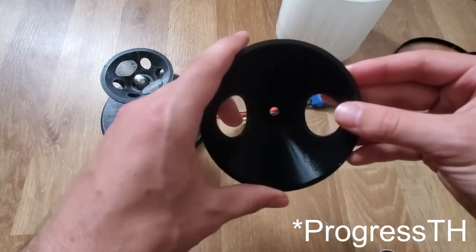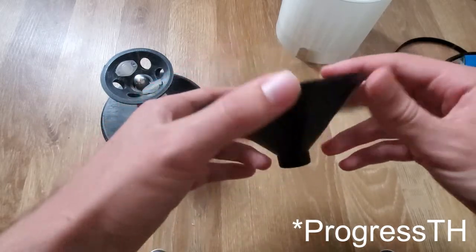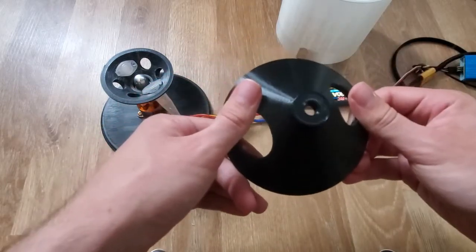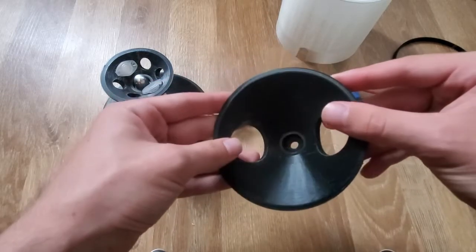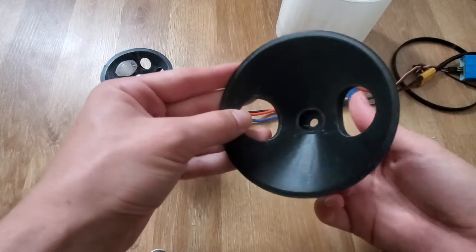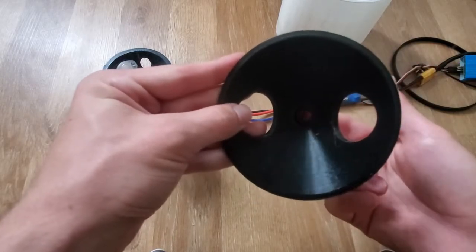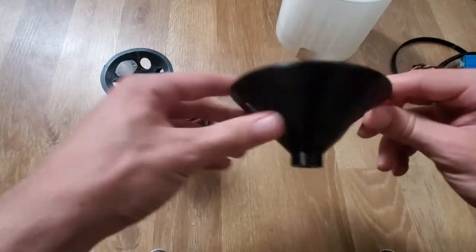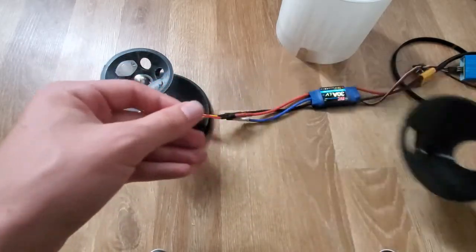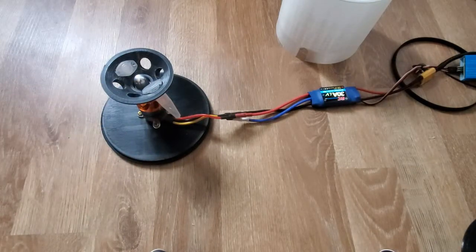I modified the files a little bit so they would work with my particular BLDC motor. You can see the motor attaches through that center hole and you've got your tubes sticking on the sides. That's pretty much it - that's all you need for the motor to work as a centrifuge.